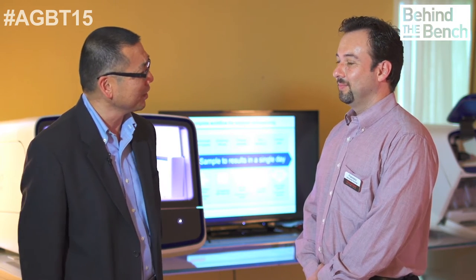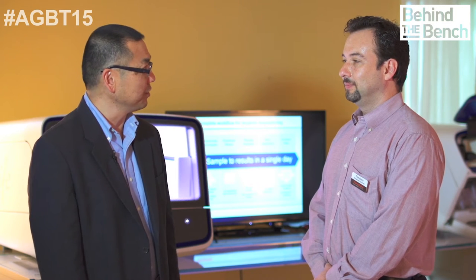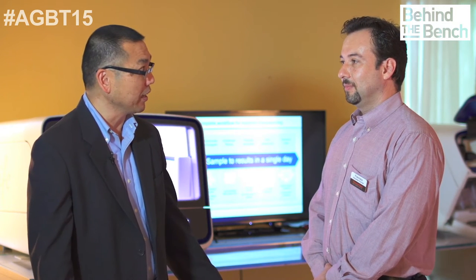What is AmpliSeq Designer? AmpliSeq Designer is actually a free website that we have to be able to do this design of the primers, basically automatically. All you have to do is put in gene information or coordinate information. You press the Go button and the design gets done and it's ready to order. It's that simple.